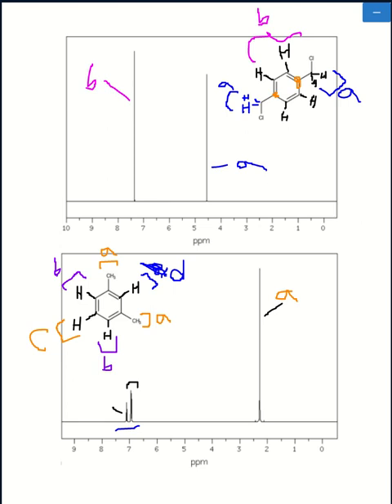Now, it does appear that one of these is larger than the other, so that could possibly mean that there are more overlapping hydrogen environments. And just to show how you would represent overlapping environments, environments B and C, they're both one carbon away from the carbons that are connected to those methyl groups. So they are the more likely candidates for possible hydrogen environments that are overlapping.